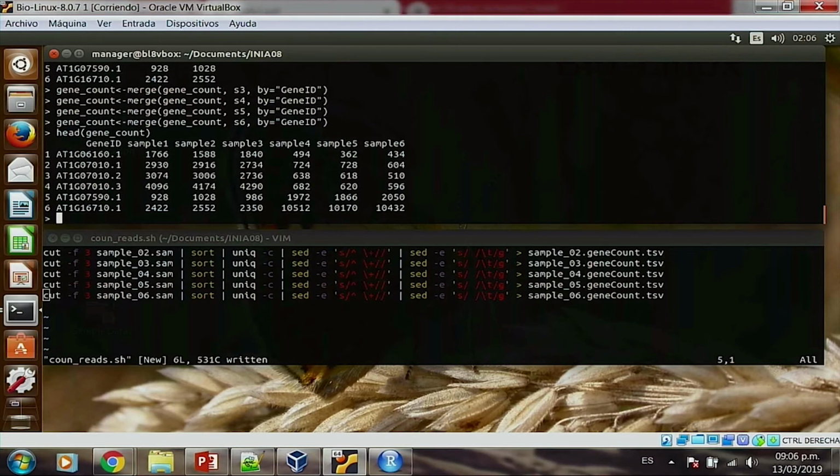That's the whole idea. This is one of the features of R. When you overwrite something, and in the operation you use the same content, what you're doing is basically updating your table. You're saying, use the results from my previous table, which are still here, add this, and store it here again.